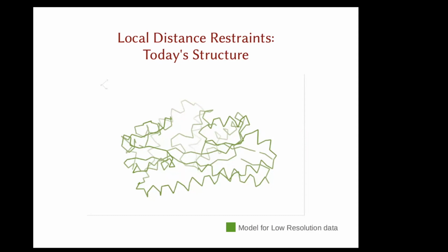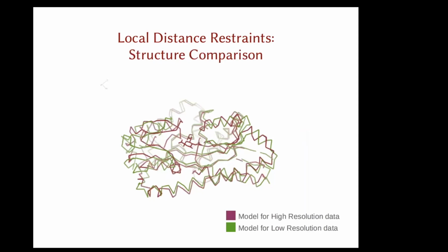And so we want to bring information from that high resolution structure to the refinement of this molecule here. So what we do is, if I do a superposition, you can see they're similar. But there is some systematic shift of the domains around the binding pocket. We ask the question, for every atom in the reference structure, what are your neighbors? And we can say neighbors consist of those that are within 5 angstrom. And then given this set of neighbors, what are the distances to these neighbors?